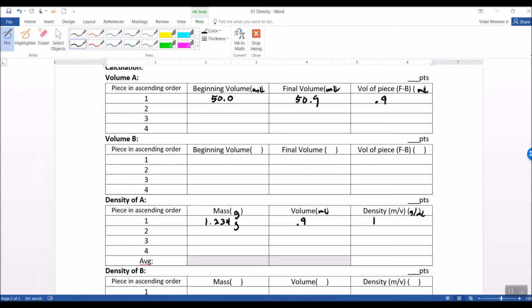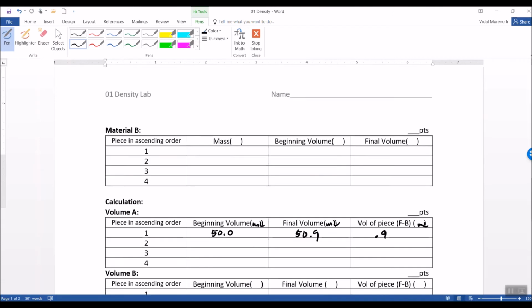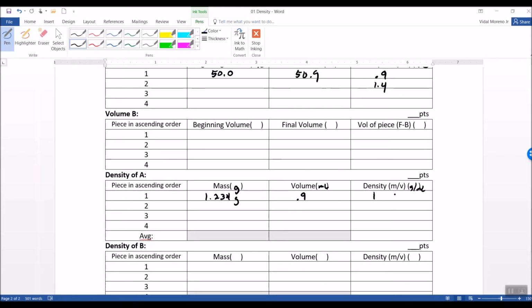Obviously, you're going to have more digits because you're going to have pretty soon 1.4. Some of you may have only one sig dig there, but the others are going to be 2 sig digs probably. So when you average these numbers up, it's probably going to average close to 1.3.